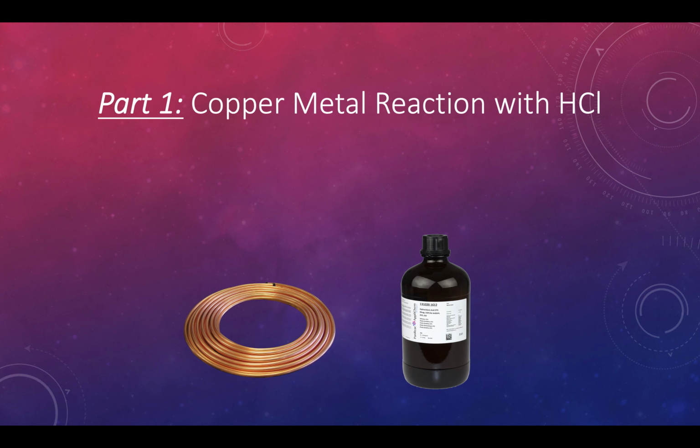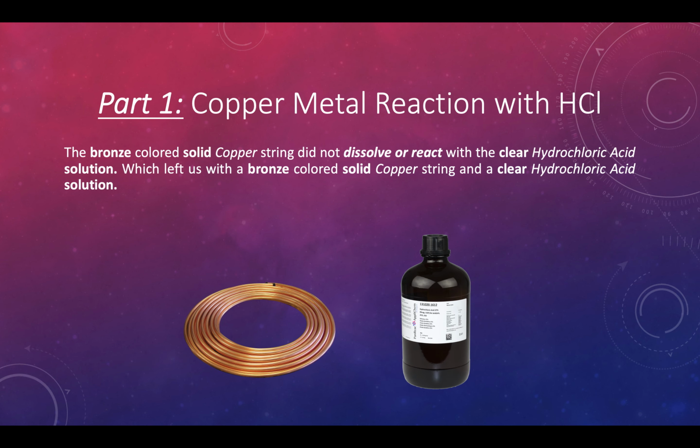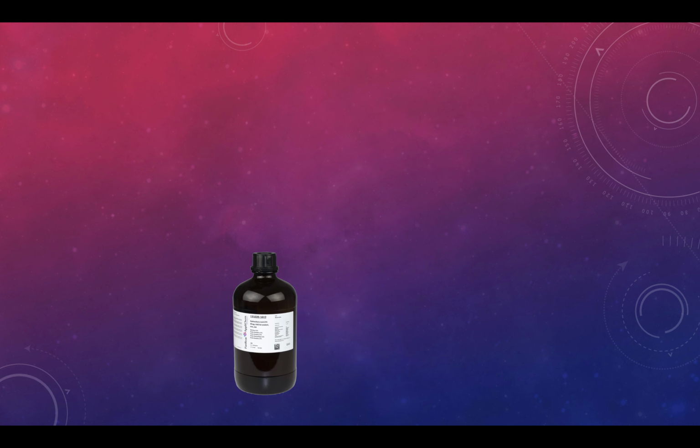So for part 1, we did our copper metal reaction with hydrochloric acid. The bronze-colored solid copper string did not dissolve or react with the clear hydrochloric acid solution, which left us with a bronze-colored solid copper string and a clear hydrochloric acid solution.